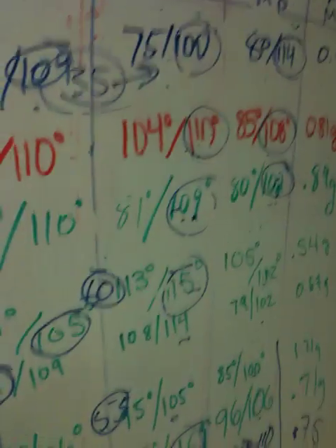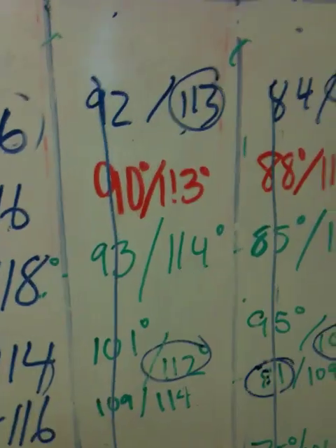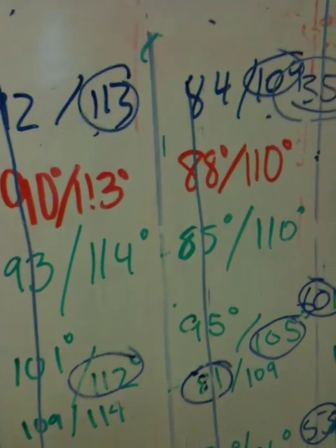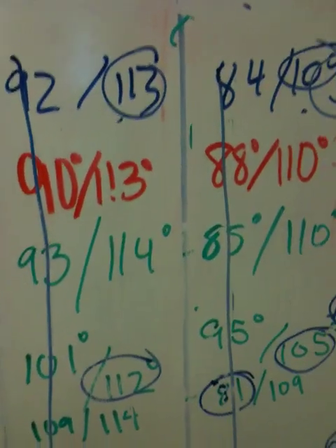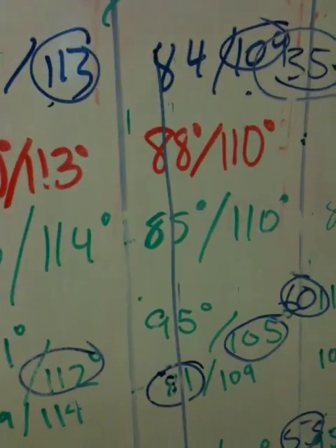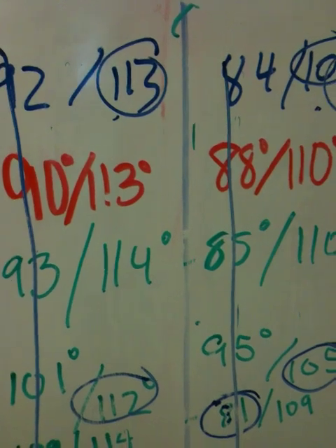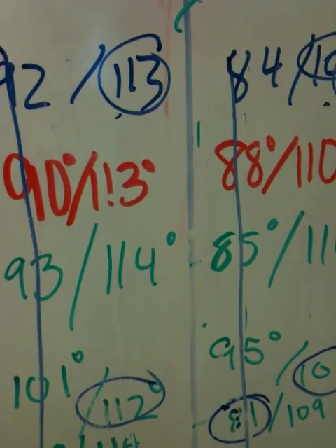Okay, we wrote down a lot of errors that can occur. I'm not going to write them all on the board now, but some of the errors in measuring melting points are just perception. The first time people melt things, they cannot often see what the end of melting is. They're not sure if it's all melted. Packing can affect melting. The sample size has a big effect on melting.